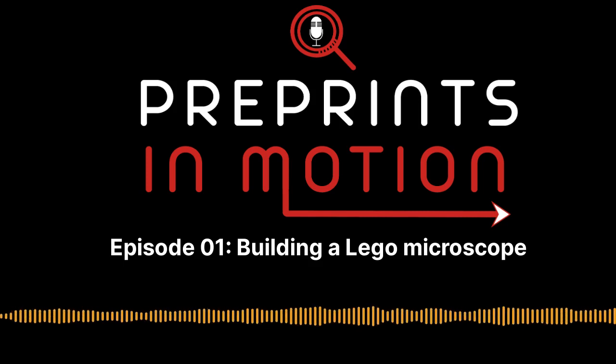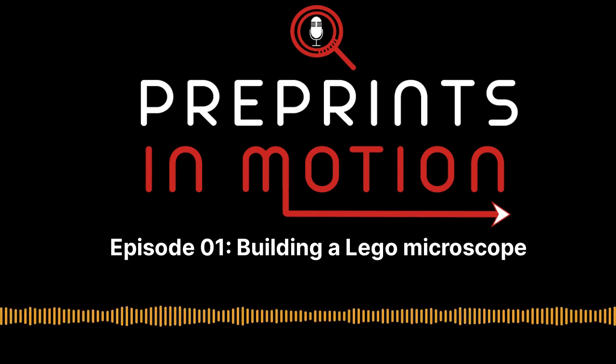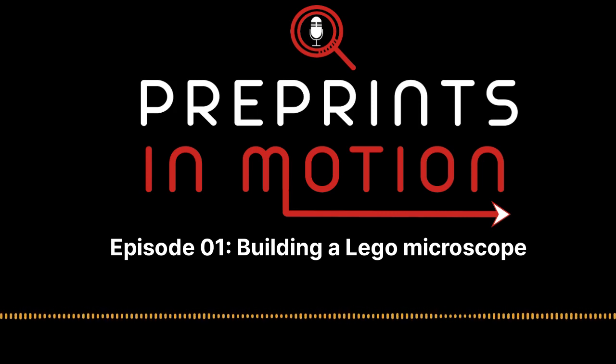And so, when you're designing a Lego microscope, what kind of resolution can you get down to with this? So in the end, we're quite close to the physical limits. We are using a smartphone camera lens. They are very good and practically for free. And then we also use a plastic lens. And combined, these two lenses give a magnification of around 250 times. And we have a resolution of around half a micrometer.